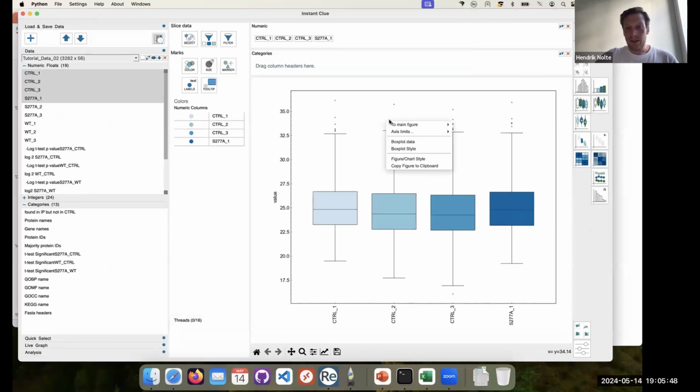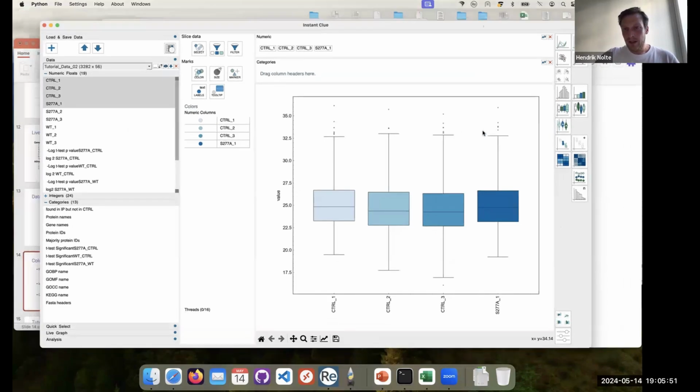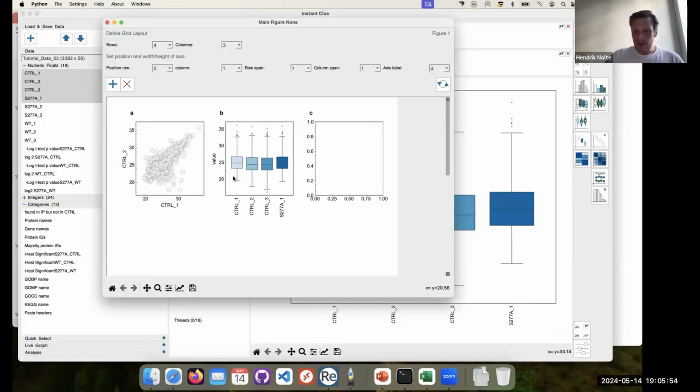We can mix it up with different kinds of chart types and then collect these data, yeah? And the main advantage is really, because probably everyone who wrote a master thesis or PhD thesis was annoyed by aligning different subplots to each other in Adobe Illustrator, in CorelDRAW, or whatever software you're using. With that, you get a perfectly aligned set of figures. It may sometimes be challenging to know the size that you want to use the chart for before you actually export it. But I think once you're using it, you get used to it.